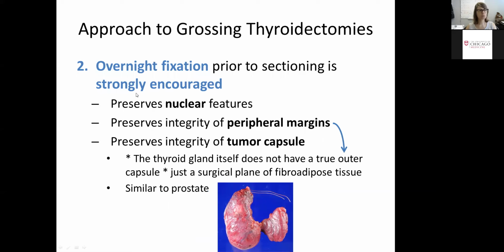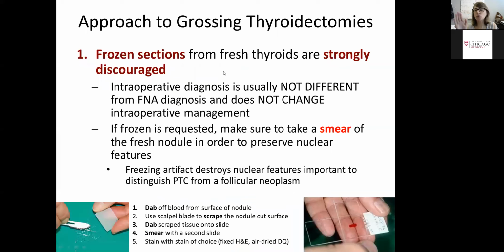Okay. So my general approach to grossing thyroidectomies in the last 15 minutes or so, we got frozens out of the way. Hopefully you won't see many of those, but if you do, you know how to handle them. Oh, I should mention, if you do get a frozen, in addition to doing that smear, you should also do the actual frozen. You should just have both.